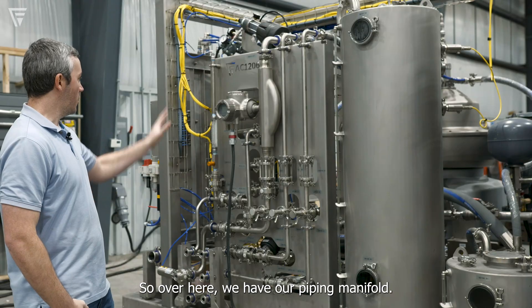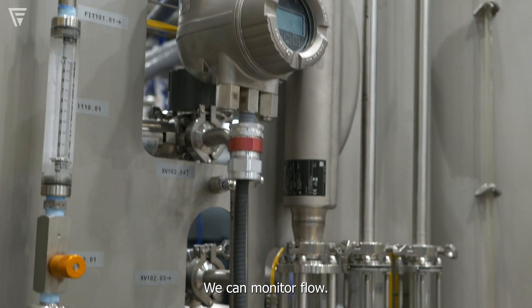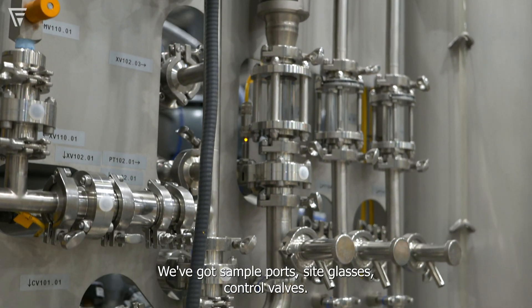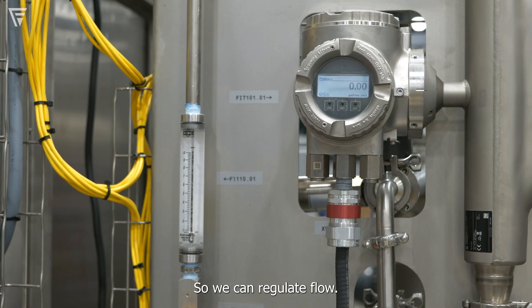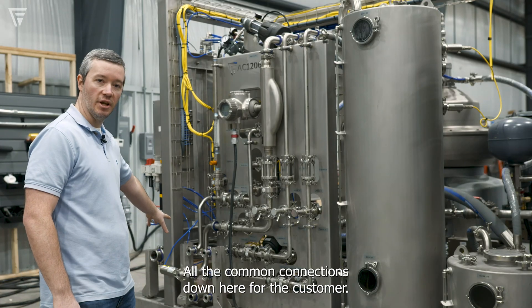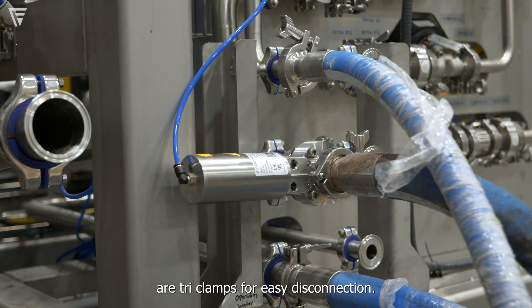Over here we have our piping manifold — this is all the inlets and outlets to the machine. We can monitor flow. We've got sample ports, sight glasses, and control valves. We can regulate flow, and all the common connections down here for the customer are tri-clamps for easy disconnection.